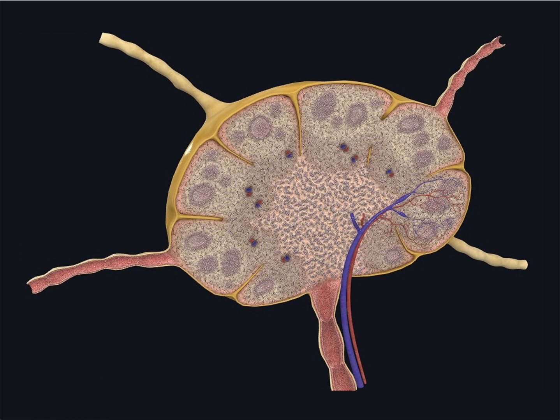Both B and T cells populate different regions of the lymph node where they're needed to synthesize and secrete antibodies or neutralize antigens. As I said a moment ago, they leave via efferent lymphatic vessels at the hilum of the node and may well pass through a chain of lymph nodes that I showed you earlier.